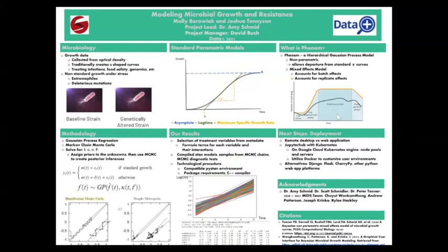Because of this infinite number of parameters, non-parametric models can have a partial amount of ambiguity and allow us to create more irregular, non-standard curves. For example, we see here below, we have the orange S-shaped curve, which would be indicative of standard growth. However, below it, we have this black, wavy, bumpy, going up and down curve. This could be a result of a non-parametric model and be indicative of that non-standard growth.